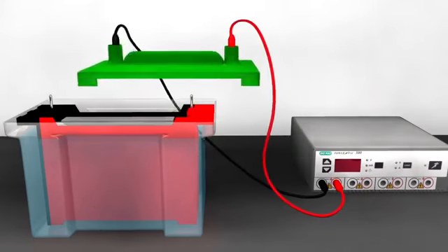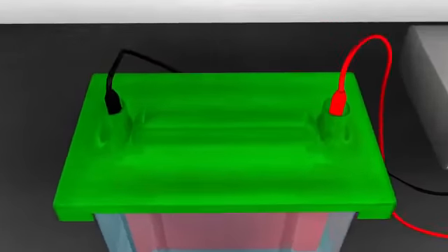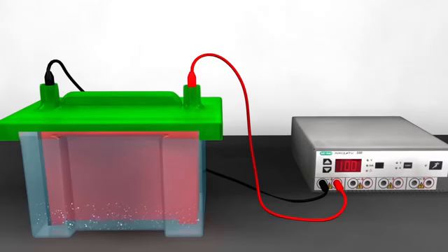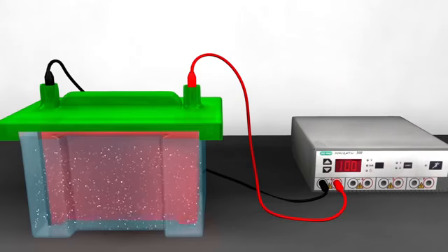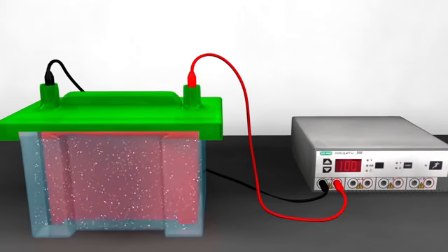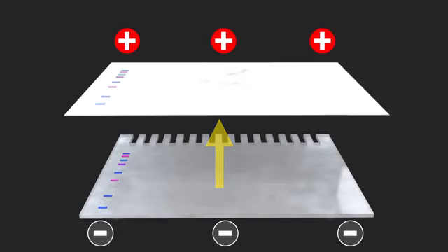The gel membrane sandwich is placed in such a way that the negative electrode is located closest to the gel, while the positive electrode is located closest to the membrane. When the electric field is applied to the chamber, proteins in the gel migrate from the negative end to the positive end of the chamber, moving out of the gel and into the membrane, to which they become tightly attached.